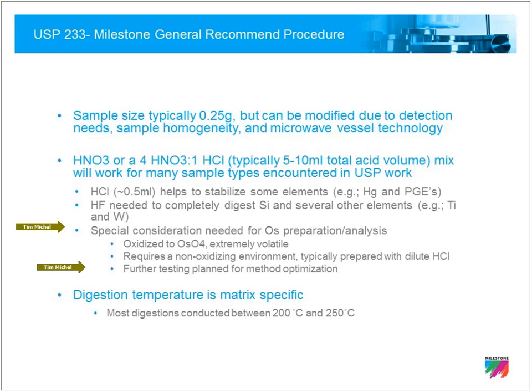With that being said, certainly, given the challenge of it, and a lot of labs in the industry are interested in it, further testing by both Milestone as well as Agilent will be performed here, and we hope to find some additional, easier methods for doing this method.